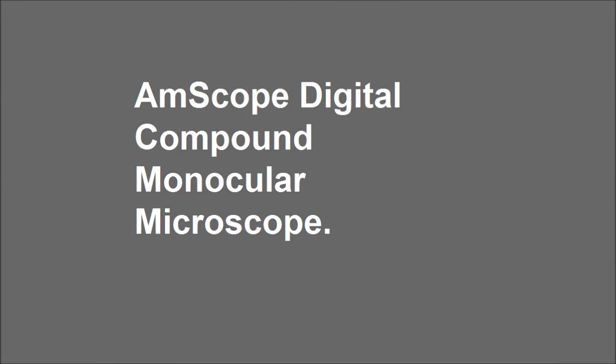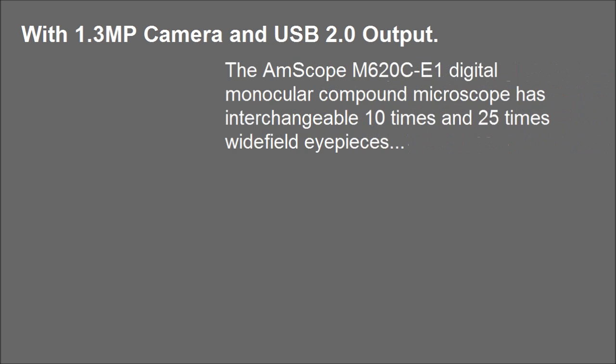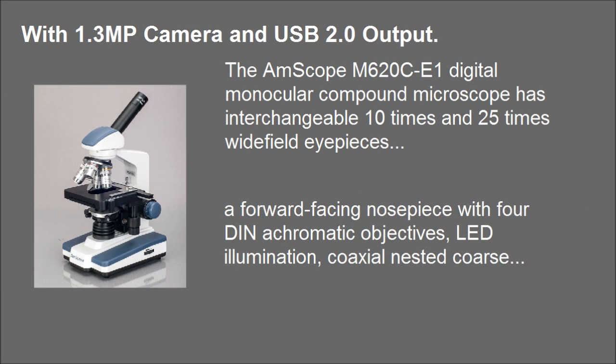Amscope Digital Compound Monocular Microscope with 1.3 MP camera and USB 2.0 output. The Amscope M620CE1 Digital Monocular Compound Microscope has interchangeable 10x and 25x wide-field eyepieces, and a forward-facing nosepiece with 4 achromatic objectives.